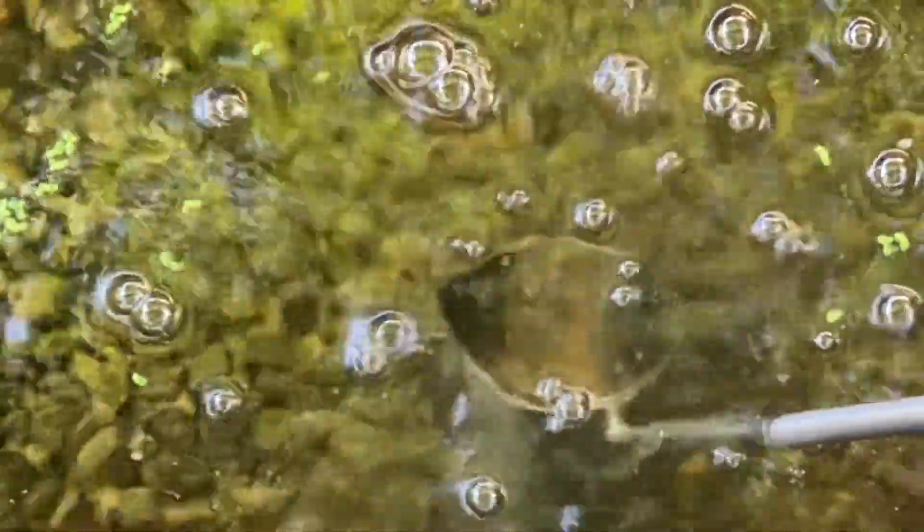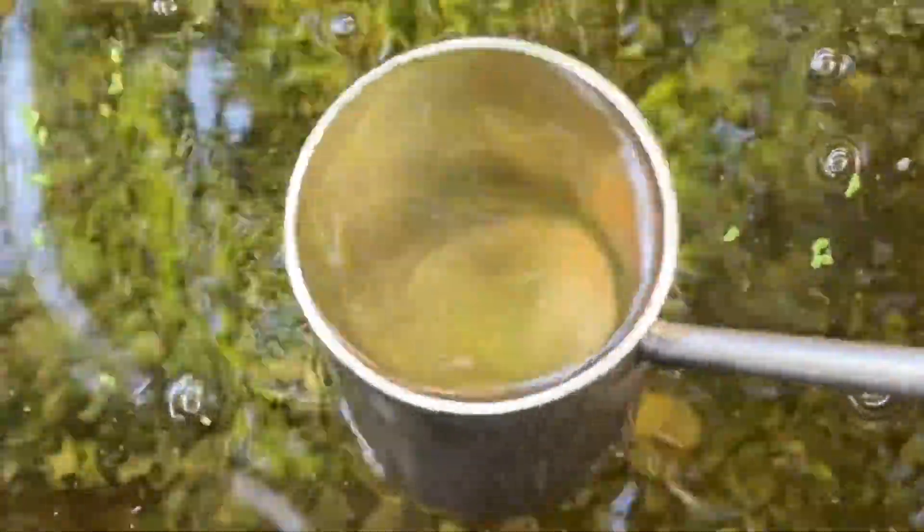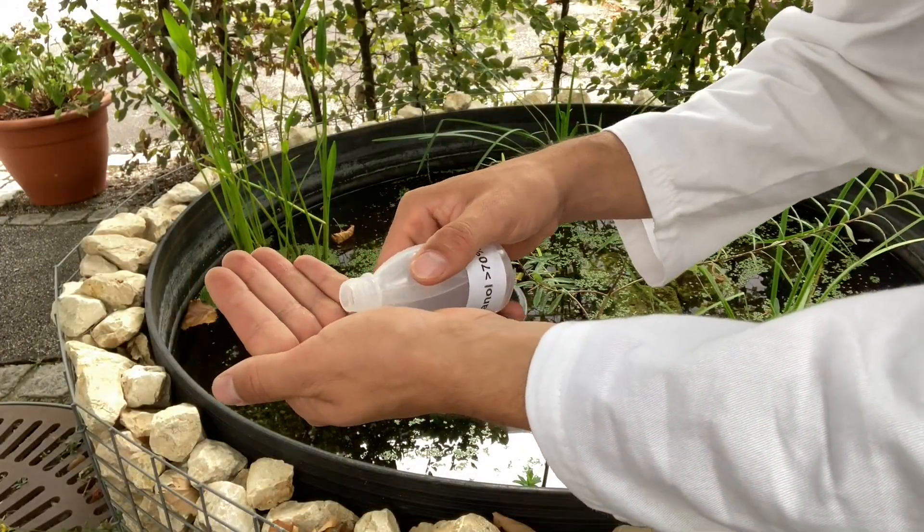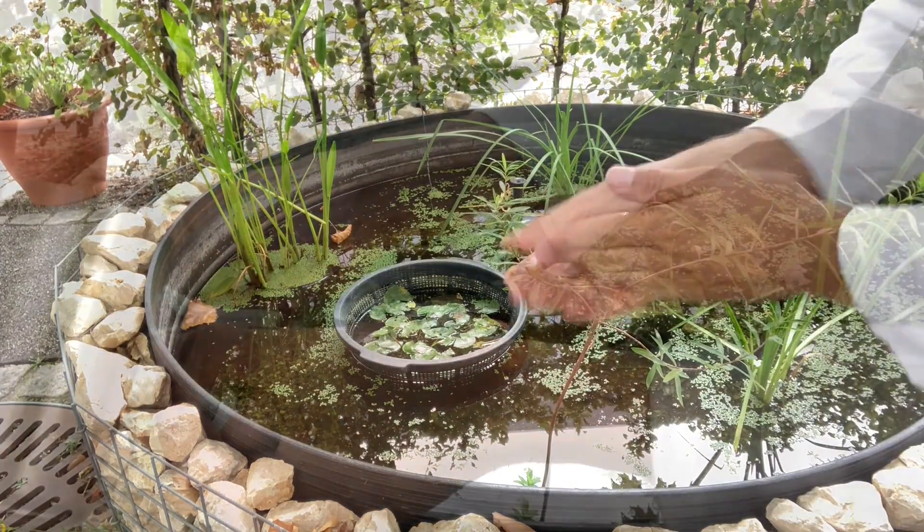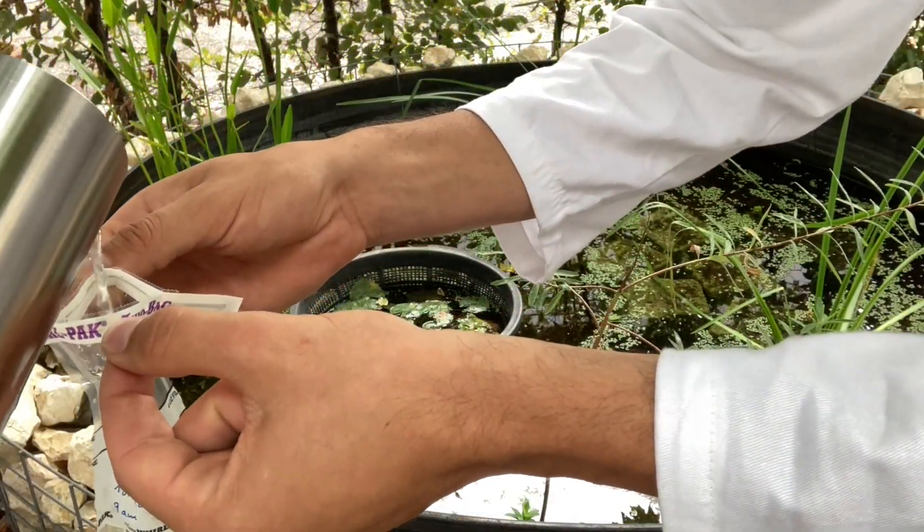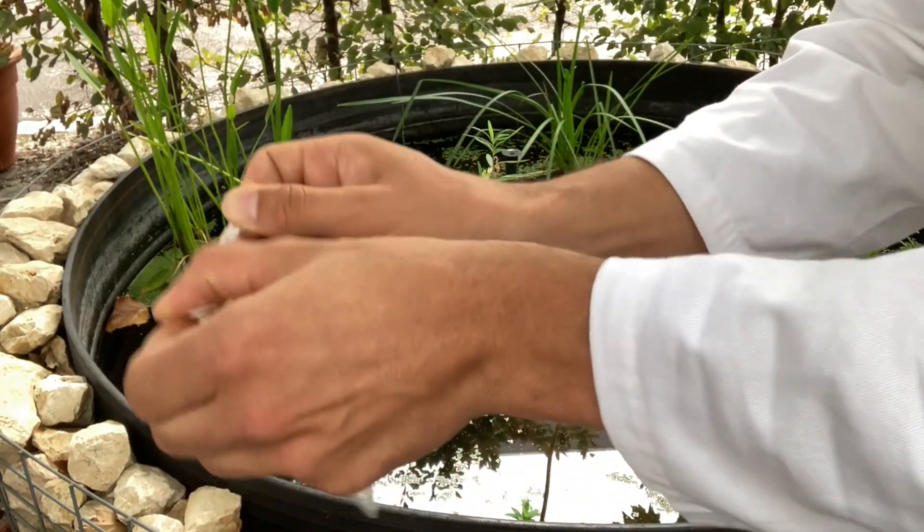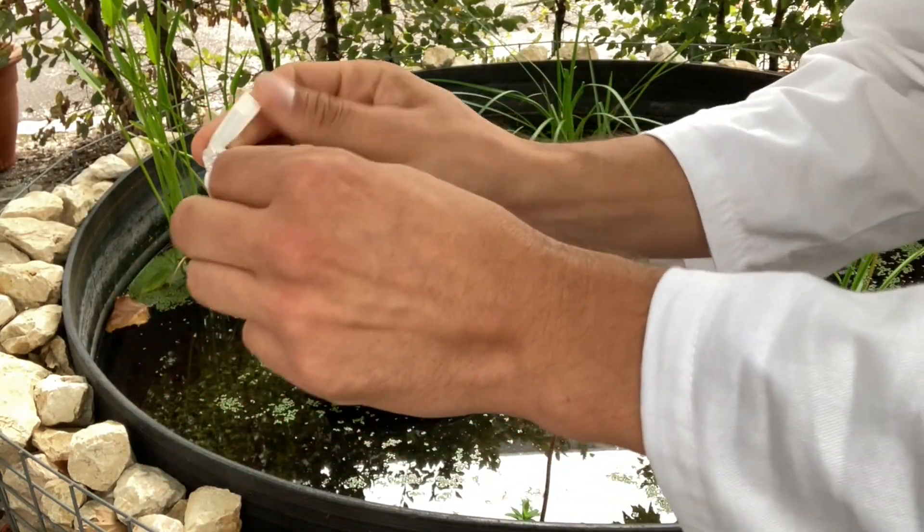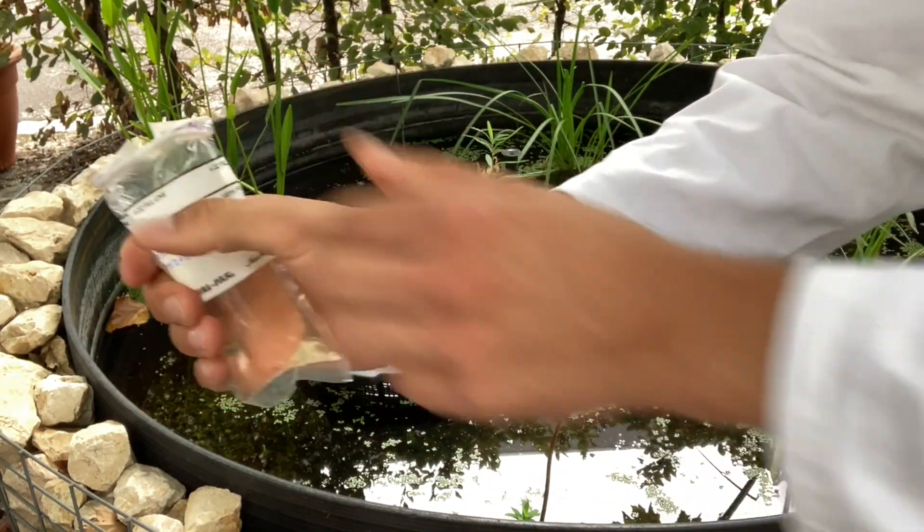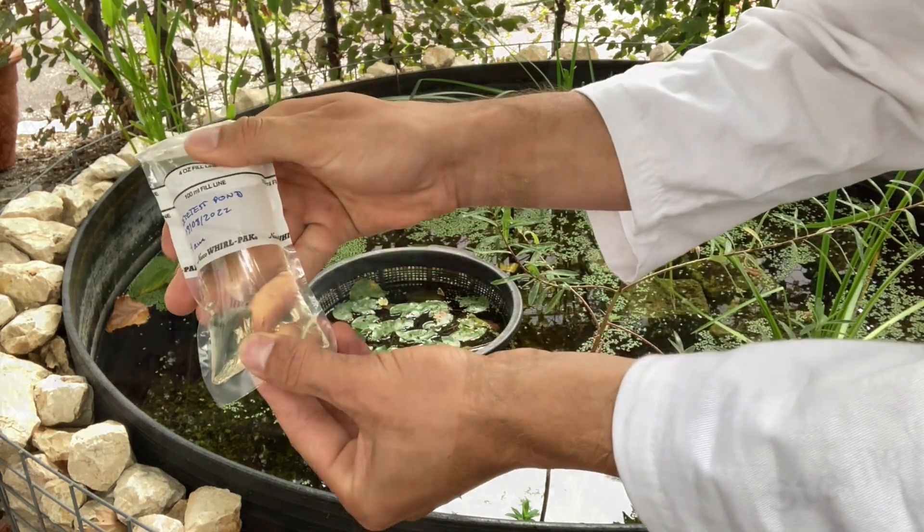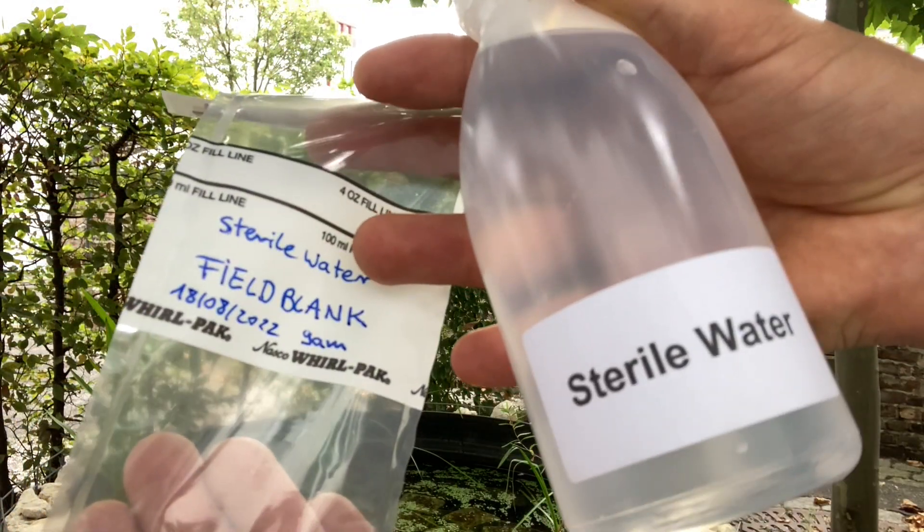Take the sample. Submerge the end piece completely below the water surface. A second person now disinfects his or her hands and opens the sample bag. Fill it slightly over 100 milliliters, then pull the wire ends, whirl the bag completely three times, and turn the tape wire inward on the opposite side of the fold.